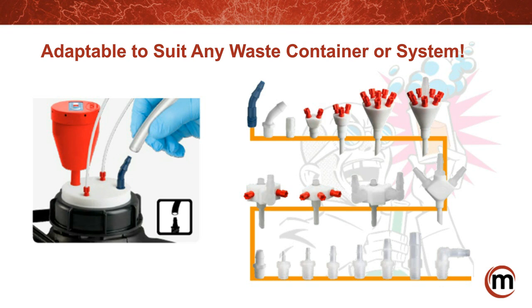Okay. And maybe the individual may want to reach out to you, or you guys could reach out to them offline. And the additional part to that is, what is the temperature and humidity of the room during the case study? It was a normal room temperature. It wasn't a high temperature. I could understand if it was a higher temperature, there would be more emissions, but they did it at normal room temperature.